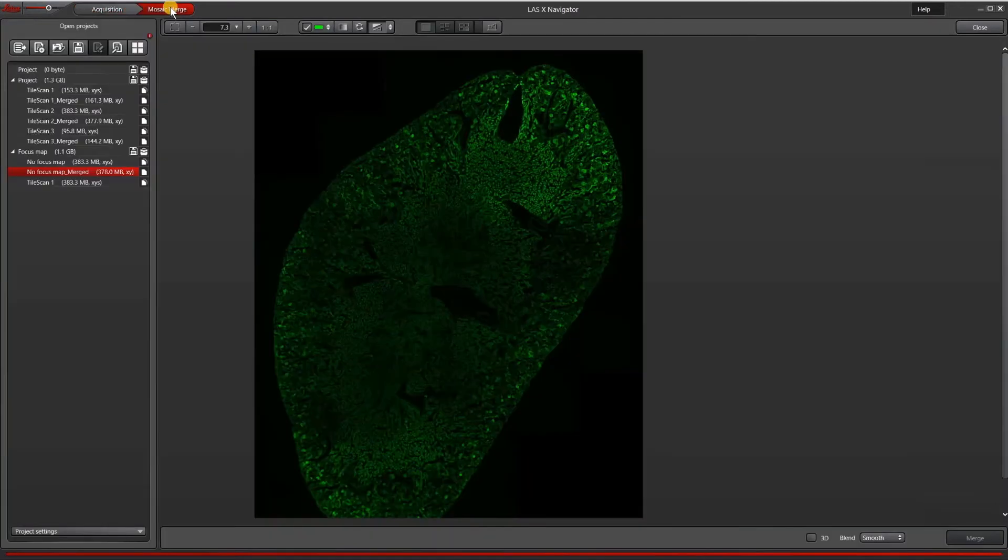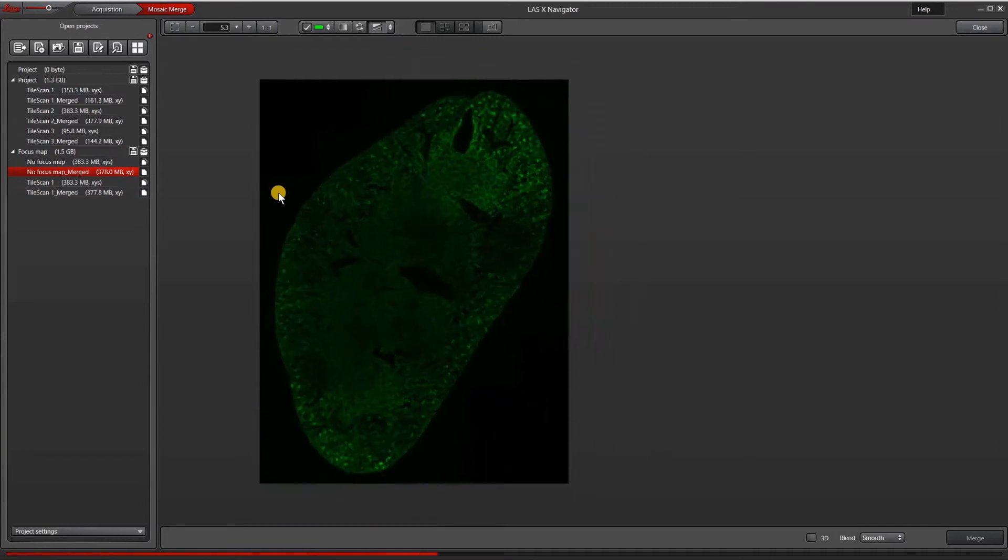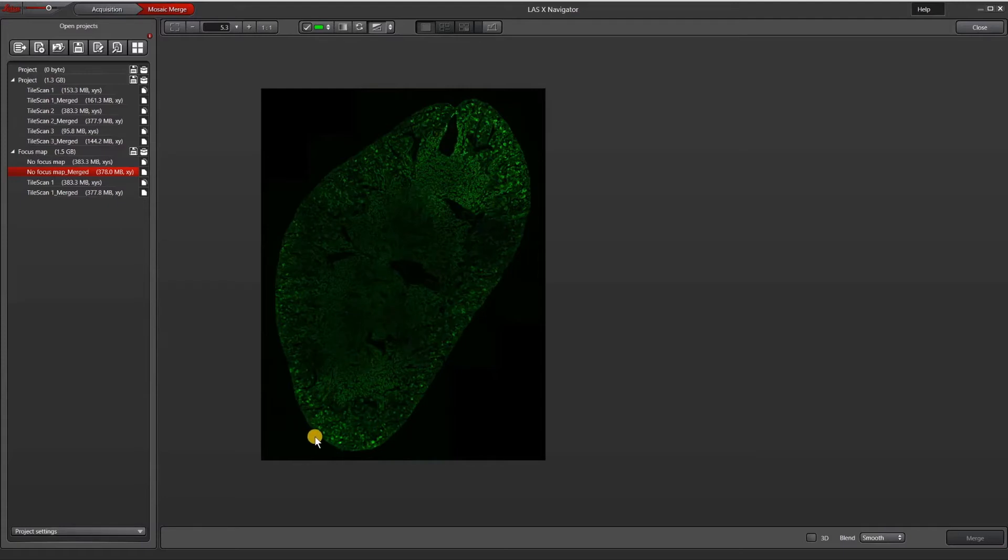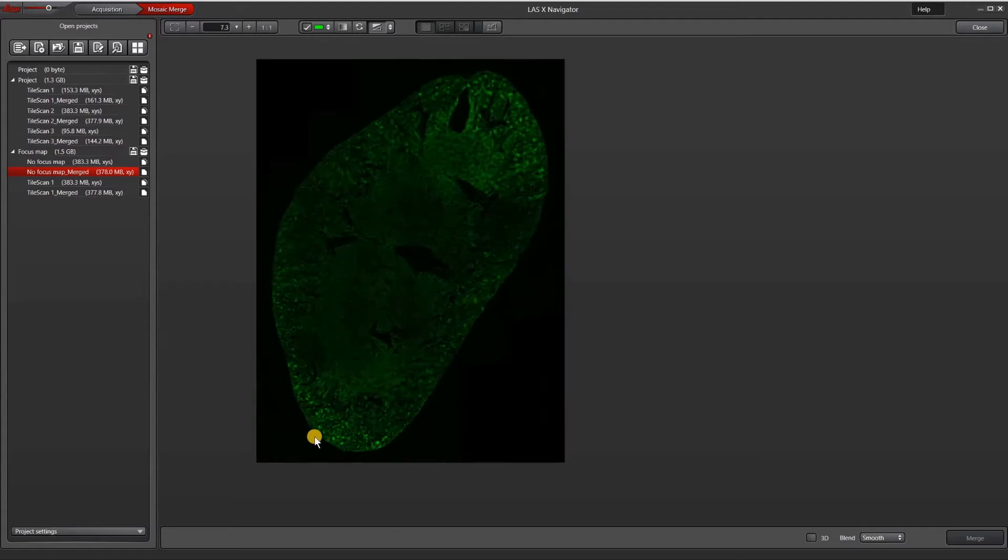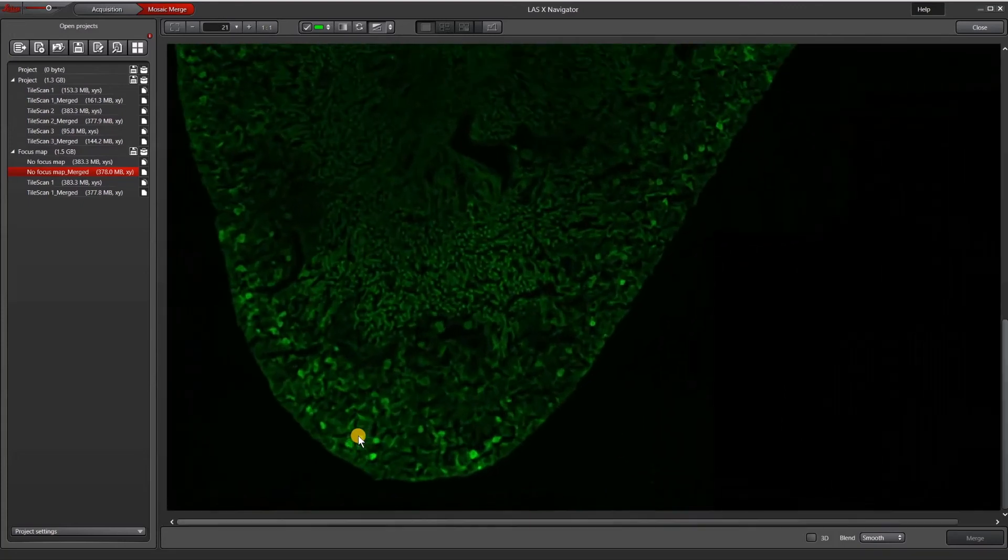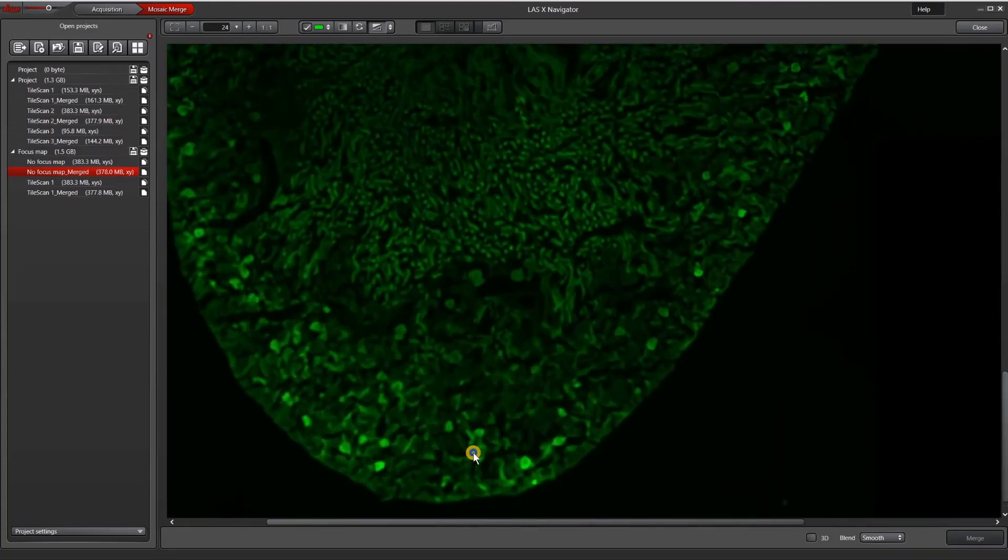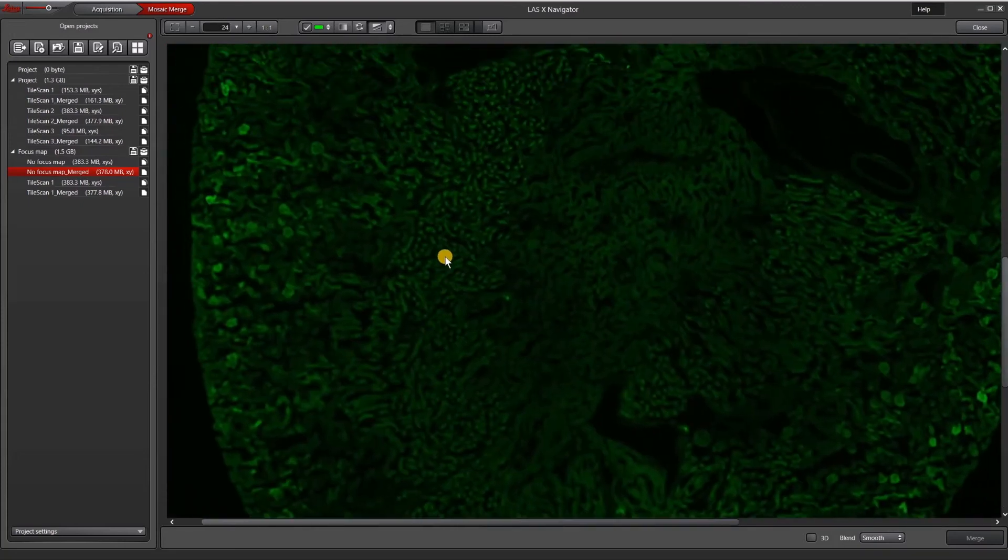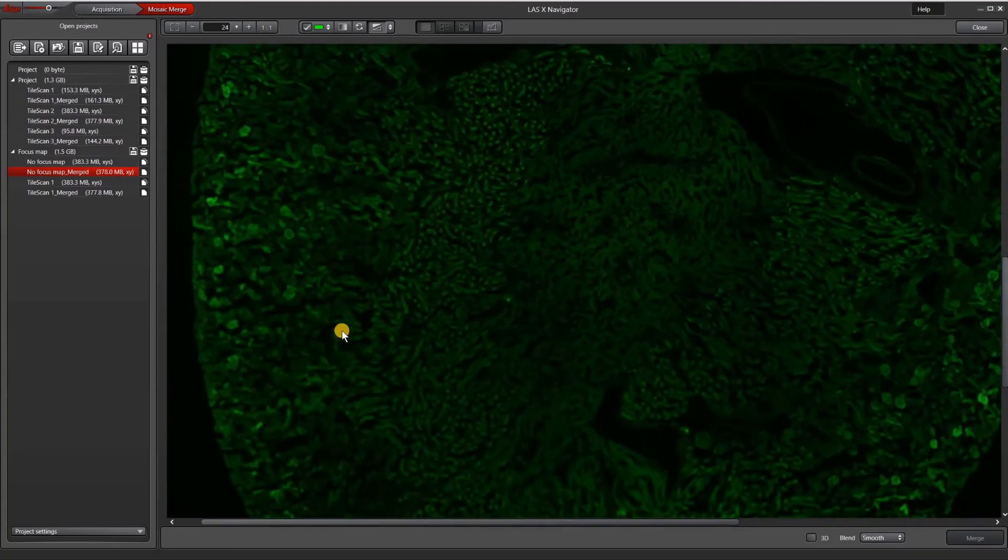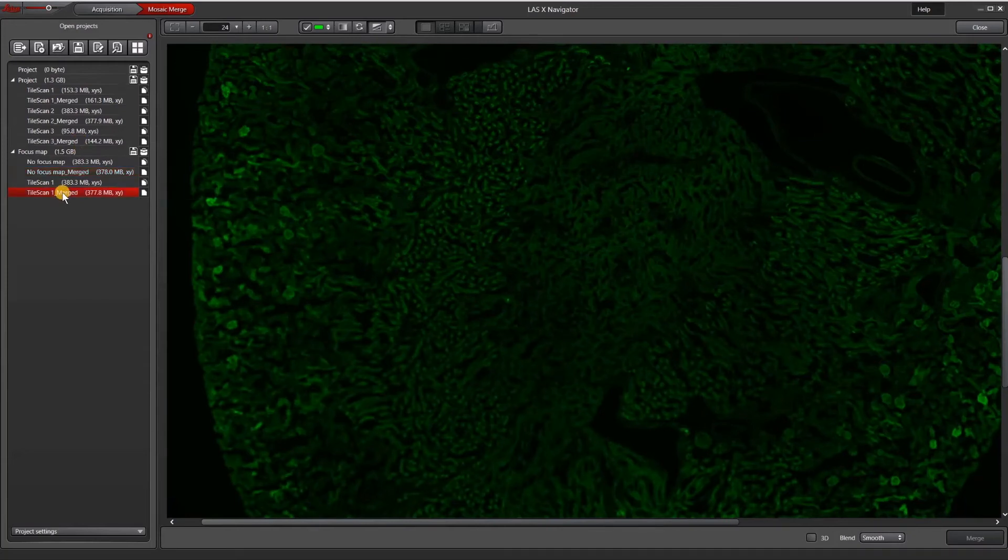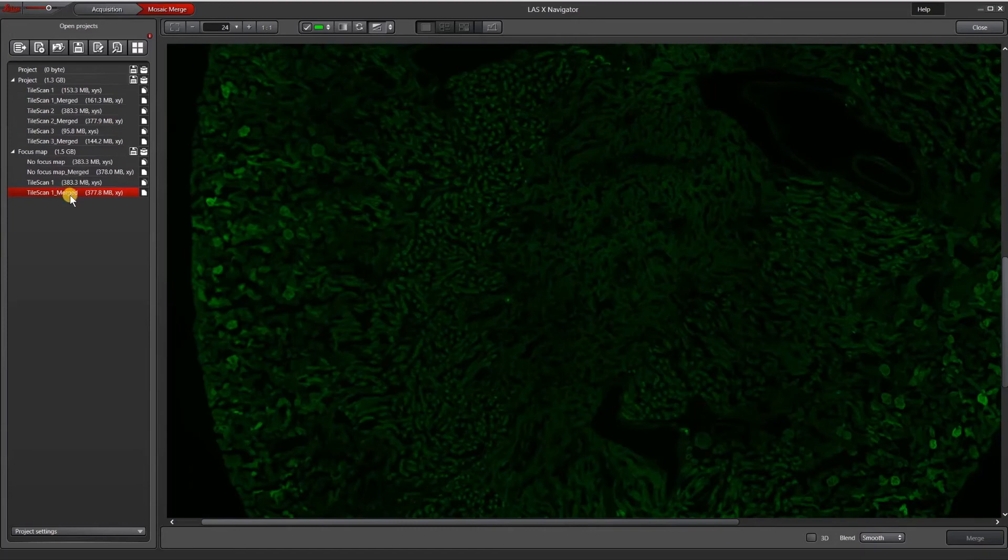Now let's compare what happens with and without the focus map. This is an image that I acquired without the focus map points. You can see that most of it is pretty good. The top half appears mostly in focus, but the bottom half here is not. And even as we go up, there are some regions here that are completely out of focus. If we switch to the section where we actually use the focus map.